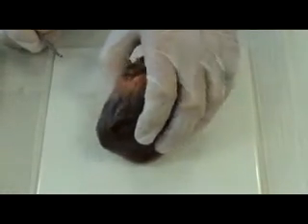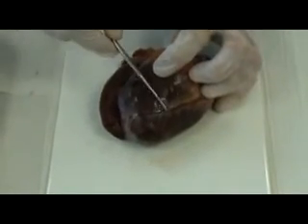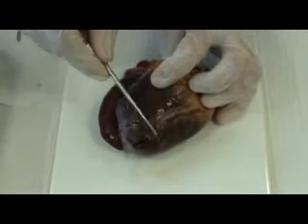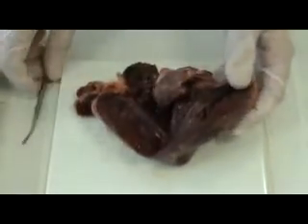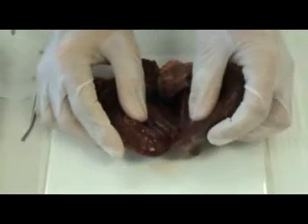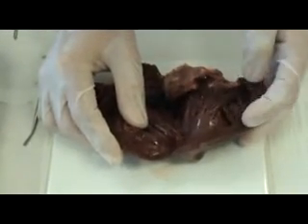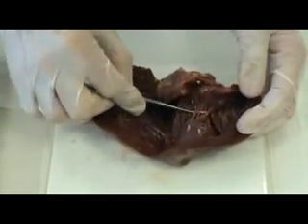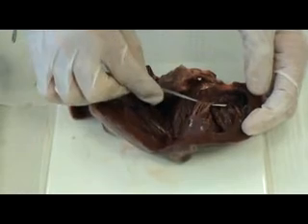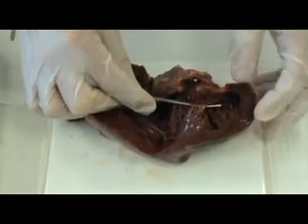So have a look at this heart, and the same procedure, look at the various chambers and see the branches of the great vein and the coronaries, the thin membrane, and have a look at the thickness, the left ventricle, fairly thick wall, and this dissected area is quite useful in that it shows a good appreciation there of the chordae tendineae.